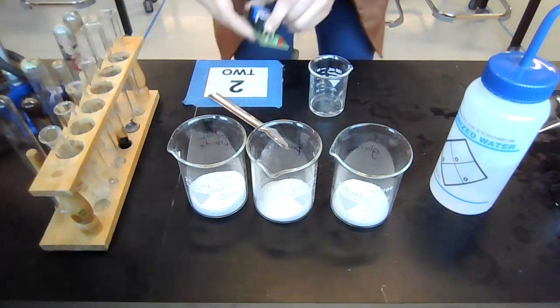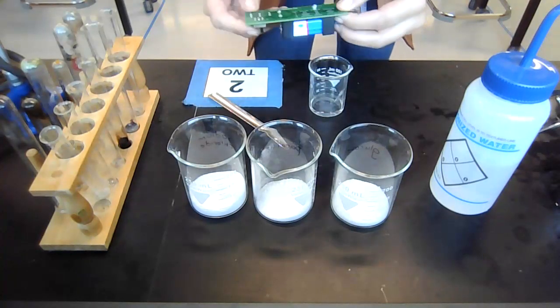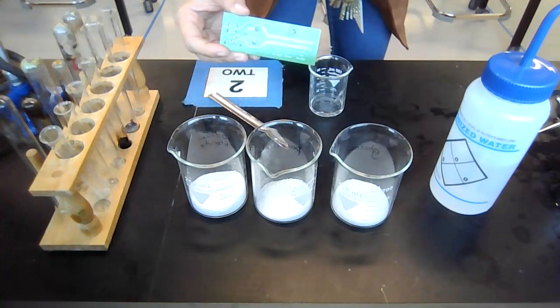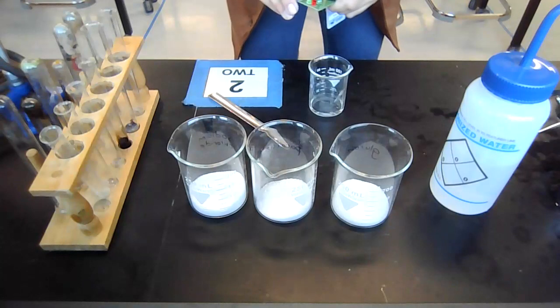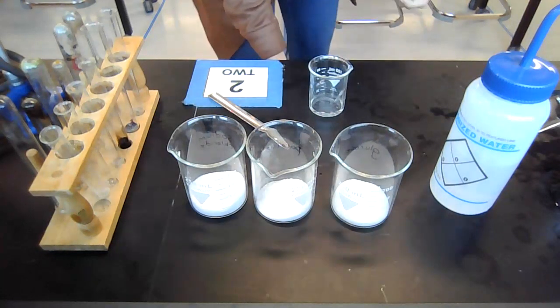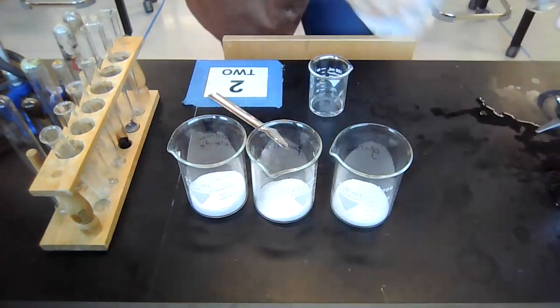Now I have my conductivity tester, which is this green one. On the back, it tells you what everything means. But basically, if all the lights turn on, it's conductive. If it's just dim or not on at all, it's not. So you can use regular water or deionized water as a baseline for this.